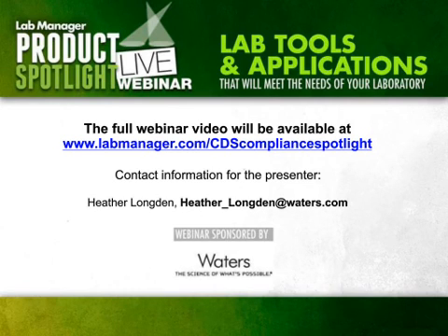I've often spent a long time with customers designing a perfect report, and then I said, well, why don't you just log in and look at the data electronically instead of relying on this paper? That really seems to be the way the regulatory bodies are going. So you can lock down reports, and I think if you are going to be using them in any kind of view, they absolutely should be locked. I'm not sure that the term validation is the right one. I think control is probably more accurate, unless there are calculations that are being performed as part of the report.